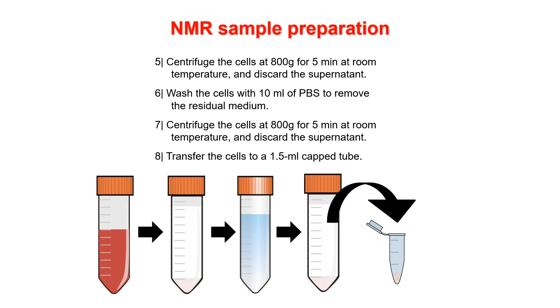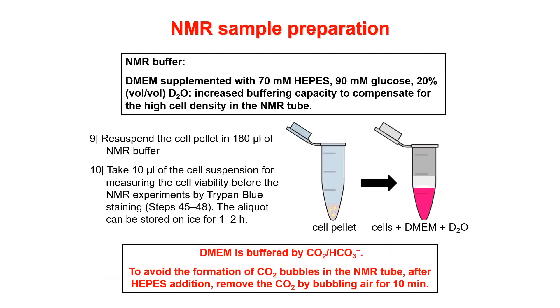To do so, I take some fresh DMEM medium — a very low amount, for example 150 microliters with a micropipette — and carefully resuspend the cells at the bottom of the tube to make a very dense cell suspension. I then pipette all of this suspension into the eppendorf tube and spin down at 800 g for about two minutes, discard the supernatant, and I have a nice pellet in the eppendorf tube.